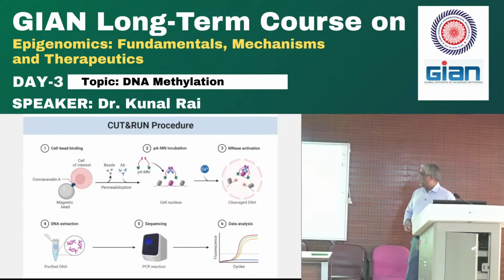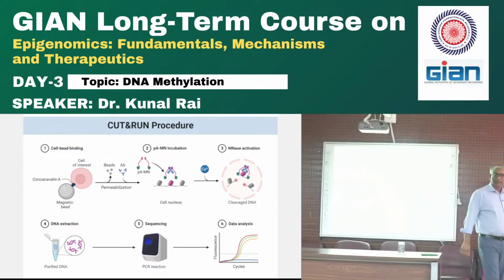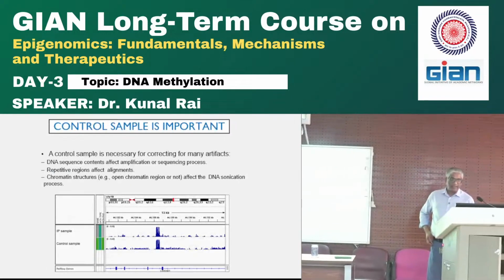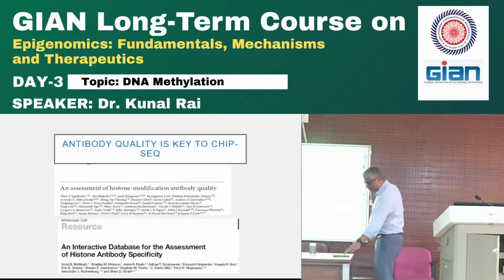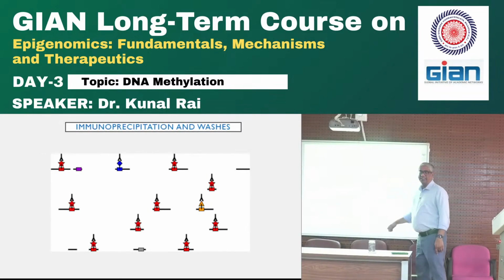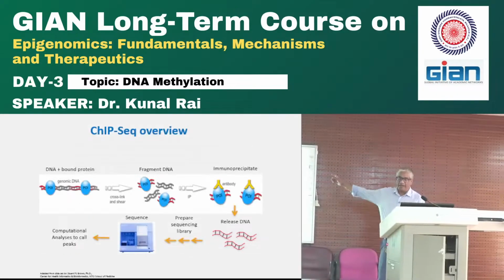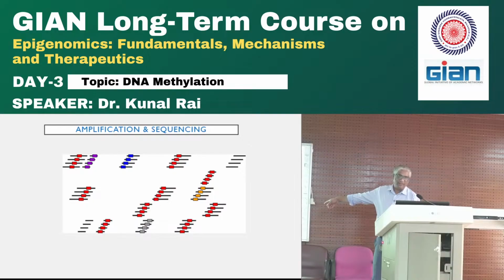However, on that note, I can take care of something which is black. Can you guess how I will take care of the black stuff? Black stuff was something which had no antibody. So look at the black stuff. It is right here. It has no protein, so no nucleosomes essentially. It's just a nucleosome-free region, but it still came along. It liked to stick to the antibody. That's how we call it. How will I take care of it?